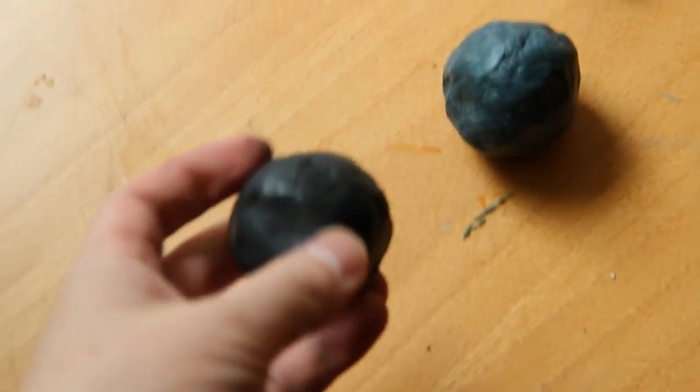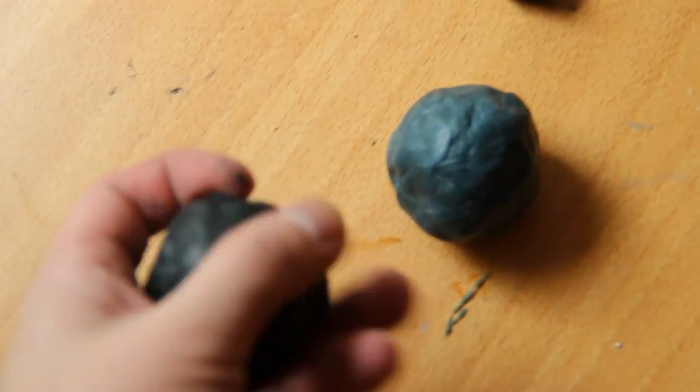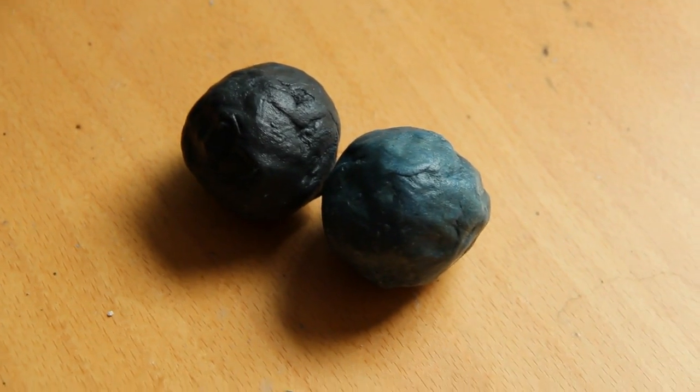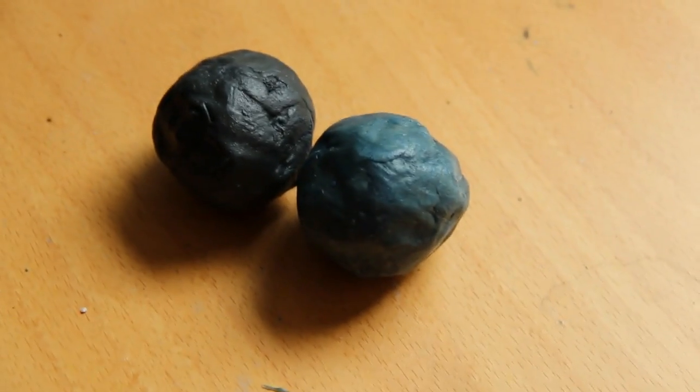The result is these balls, which sort of have the consistency of plastic — very hard — but if you put them in warm water, they soften up. These two balls are going to be put in warm water and kneaded when they're softer. This will be done once a day for three days.